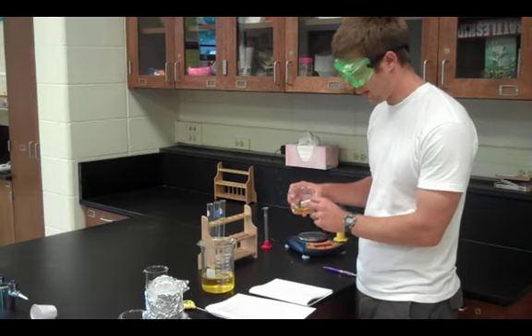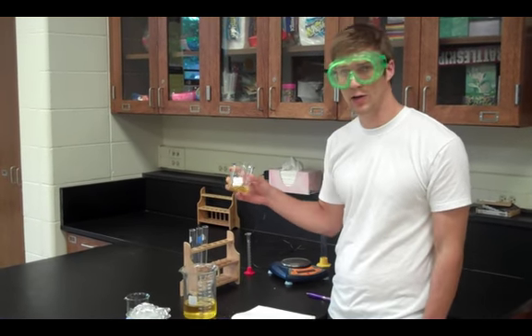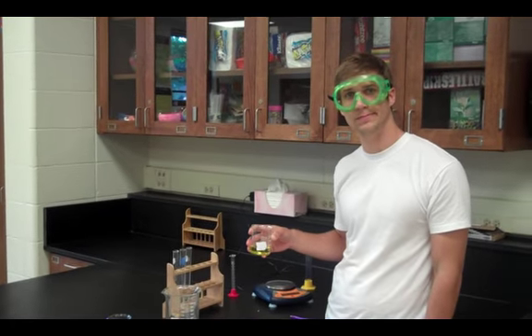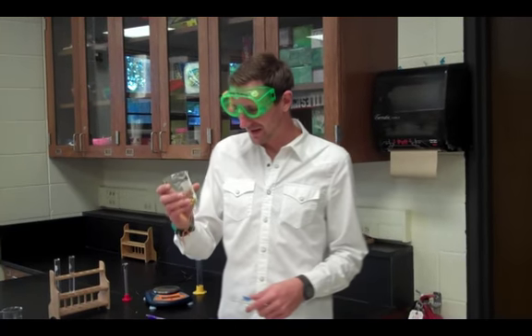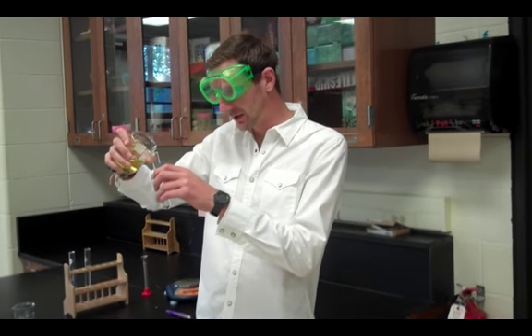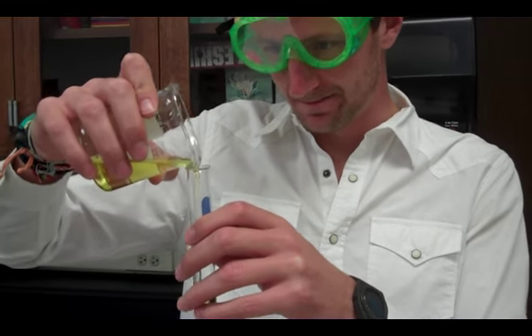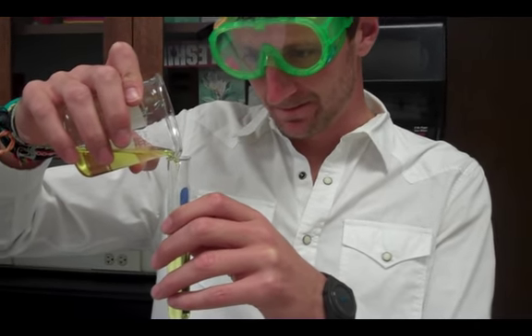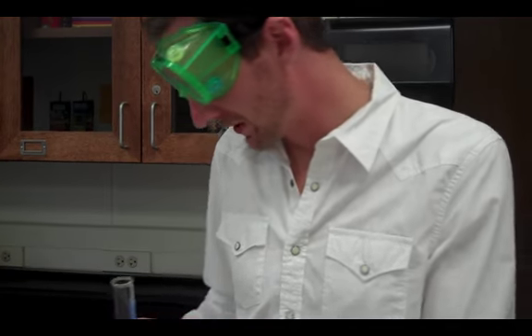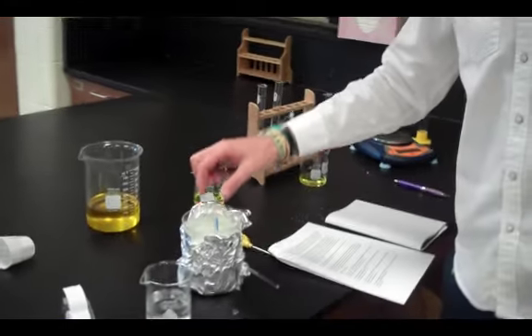So again, solution A is 5 grams in 50 milliliters of water, and solution B is 10 grams in 50 milliliters of water. Alright, once you have your solutions, I'm going to take my first solution, solution A, and I'm going to fill my test tube up about halfway with solution A. And I'm going to put it into my ice bath.